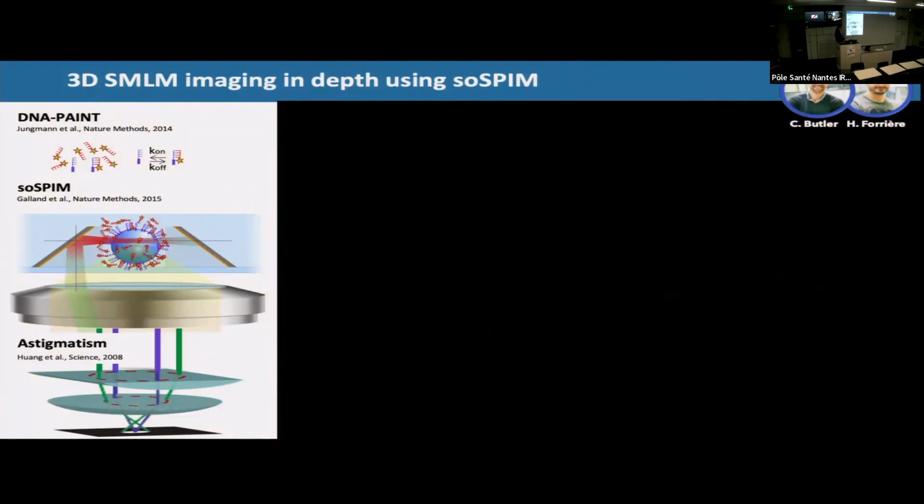It is not prone to photobleaching, but as you can see, the point with DNA labeling is that if you don't have optical sectioning, you will have a huge background. So you cannot go with wide field illumination, otherwise you will shine all your fluorophores, which creates a big background. This is why we really wanted to combine them here, and then to get 3D localization, we use astigmatism.